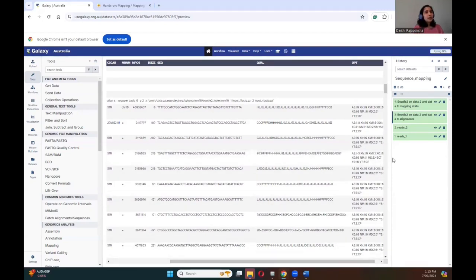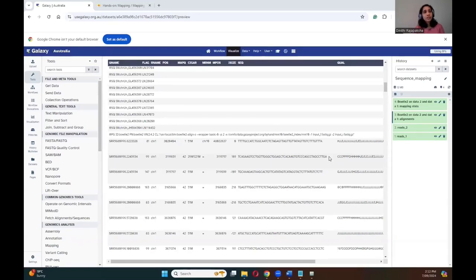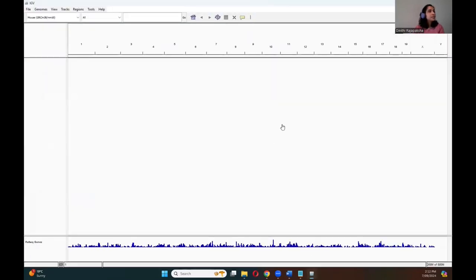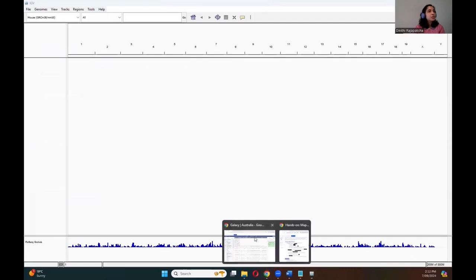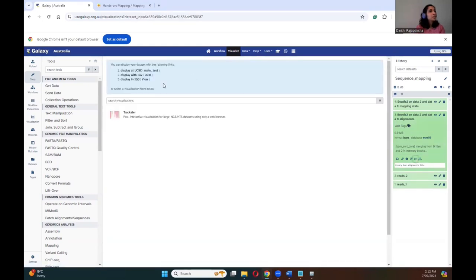Please note that BAM files are usually compressed files, but Galaxy allows us to display them in a human-readable manner. These BAM files provide the raw alignment data. If you want to visualize this alignment we need to use a special-purpose alignment viewer. One such viewer is IGV — the Integrative Genomics Viewer. To visualize the alignments using IGV you'll first need to install it on your computer. In the alignments file, go to the visualize option and select 'display with IGV'.